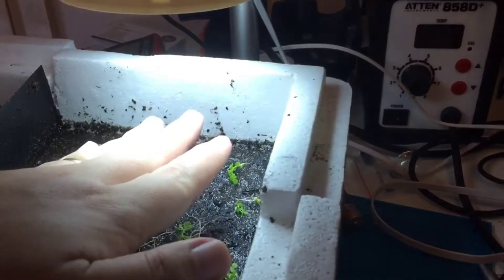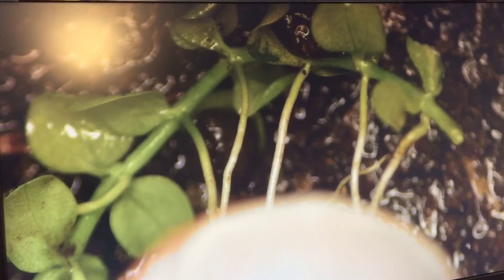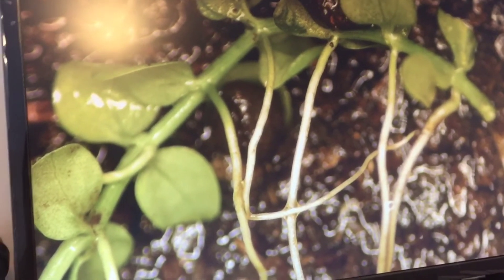I'm going to put my hand underneath the camera so you can see my fingers for scale. So right here — there are five roots as you can see clearly. Monte Carlo grows one root per node, and this is the root that goes down into the soil.